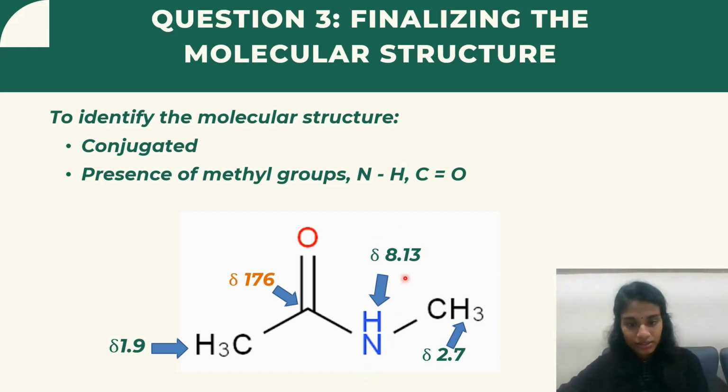That is how we have to arrange the molecular structure. Next, the C in the middle here, the C double bond O, represents the carbonyl group. The C is arranged in the middle between the C and another N. Why? This is because the CNMR already mentioned that it is off-resonance proton decoupled, with a value of 176 and one singlet.